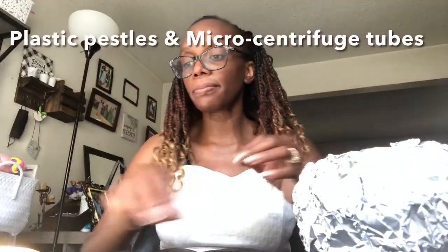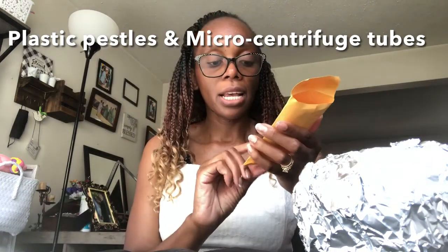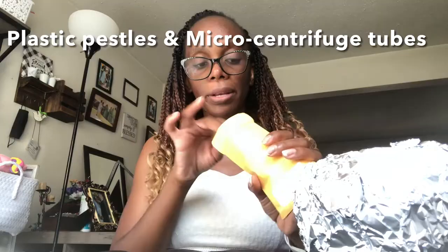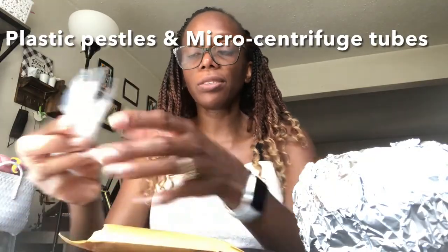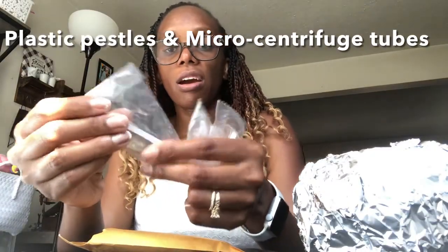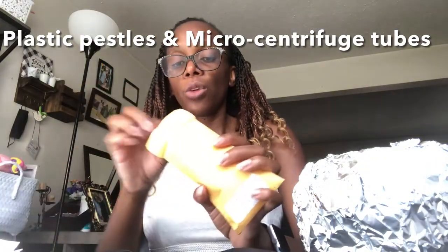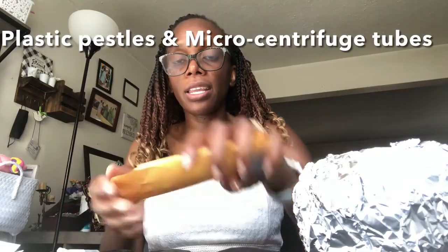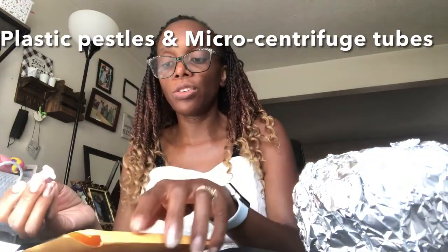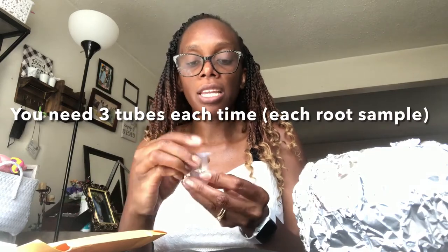Then you have your envelope in the lab kit that says microcentrifuge tubes and plastic pestles. These are the plastic pestles. They are individually wrapped, so they're kept sterile. You will need one for each location, each pot. And then you have the microcentrifuge tubes. You should have 5. To start with, you just need 3.